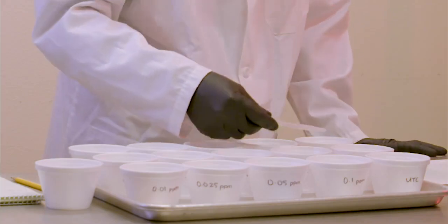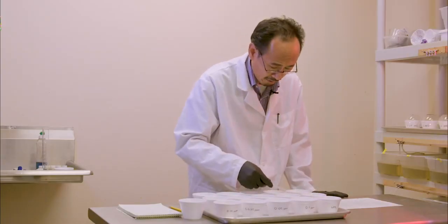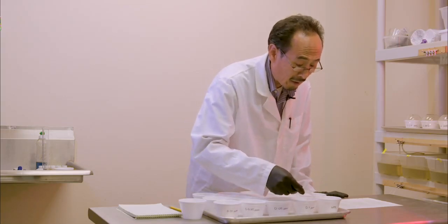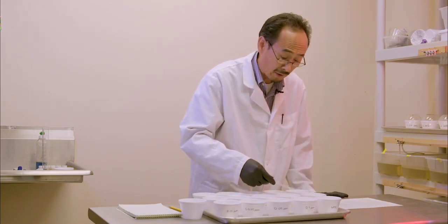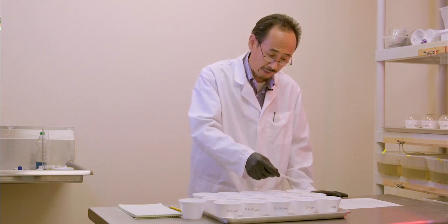Your untreated control, you should not have a noticeable mortality here. In my test here, I do not see any cadavers down to the bottom of the cup. I mean, I almost have a 0 mortality, but I don't know for sure until I read.